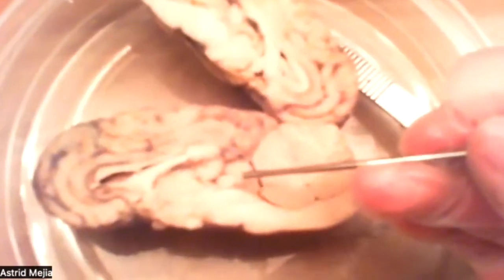Okay, and then I have the pineal body. The pineal body would be right here. And the pineal body serves to receive information about the state of the light-dark cycle from the environment and convey the information by the production and secretion of the hormone melatonin.